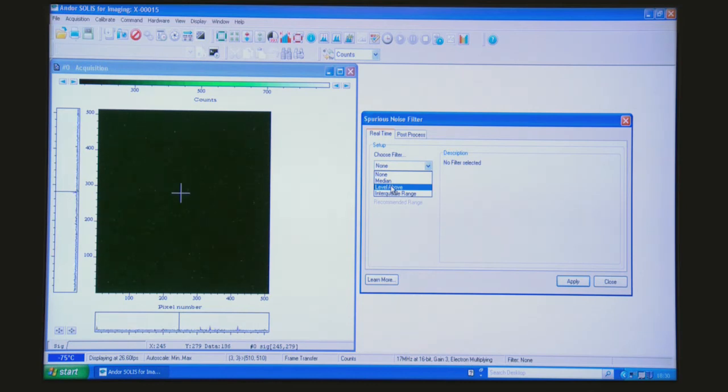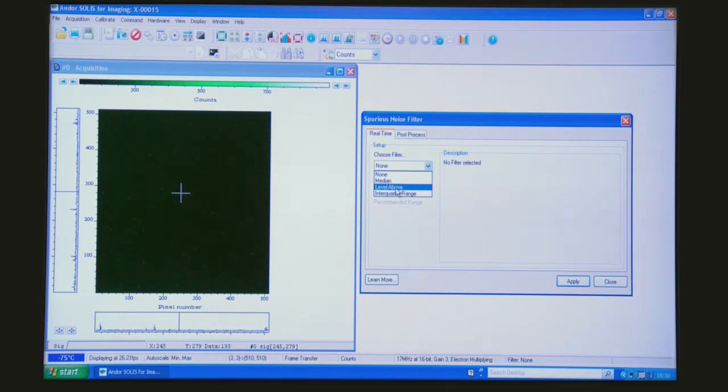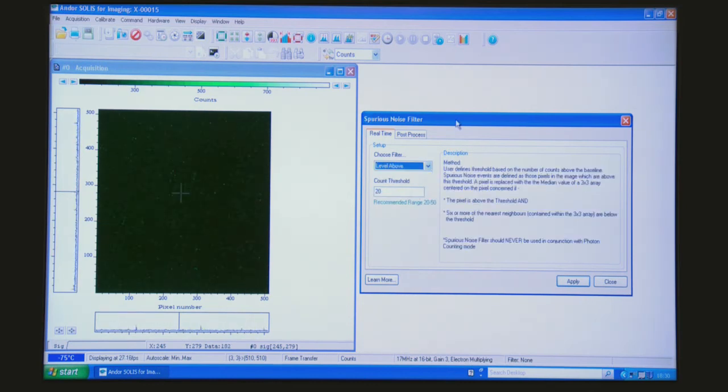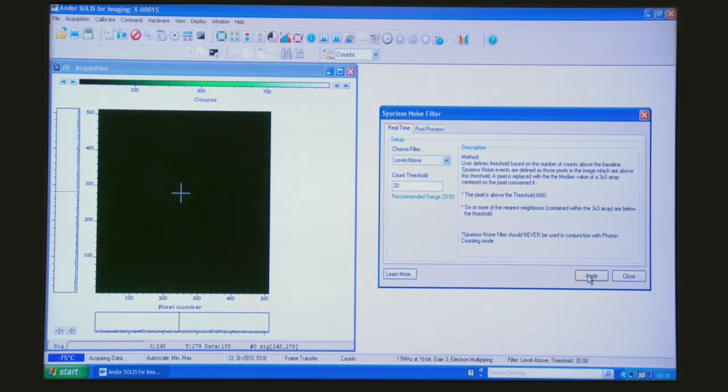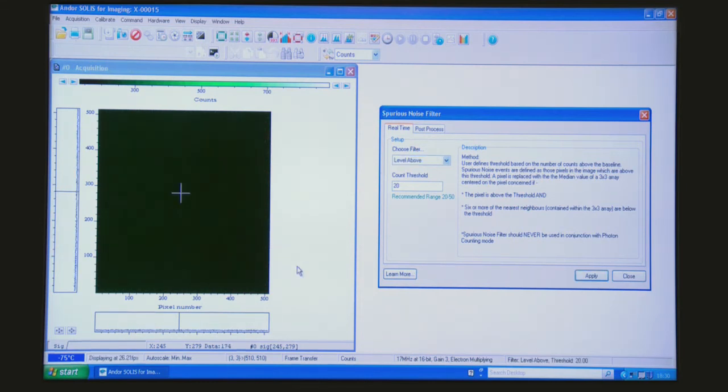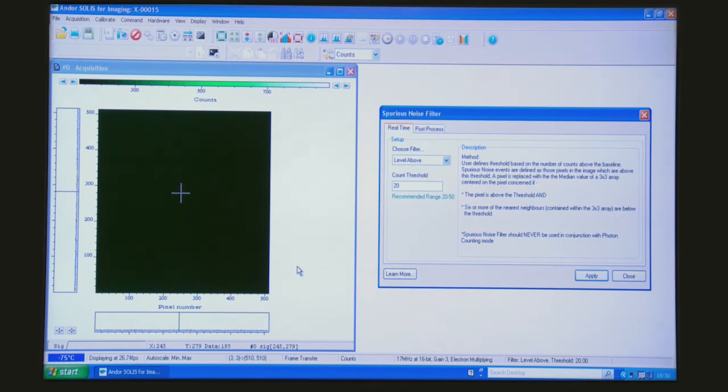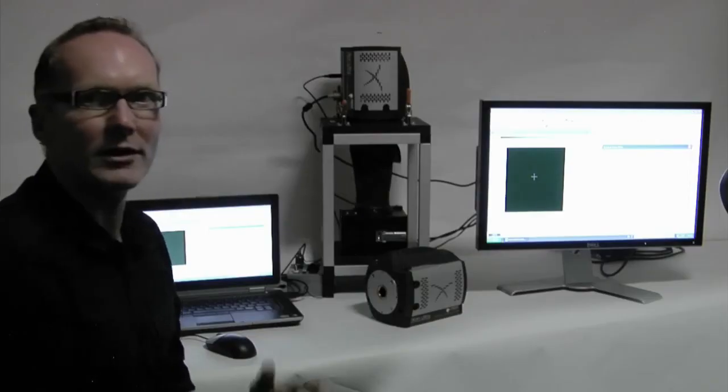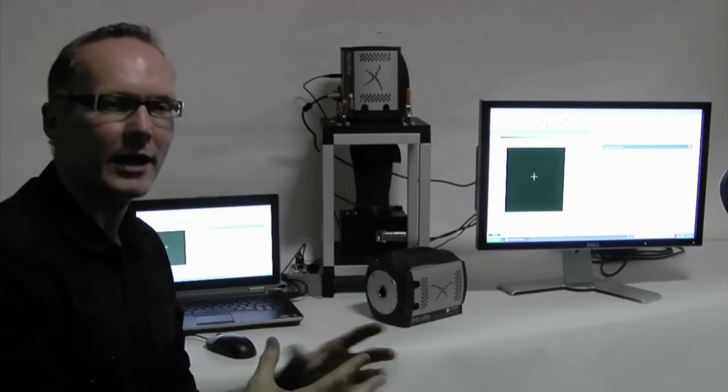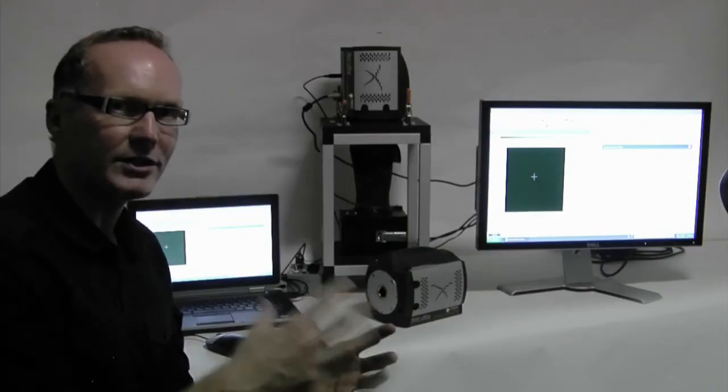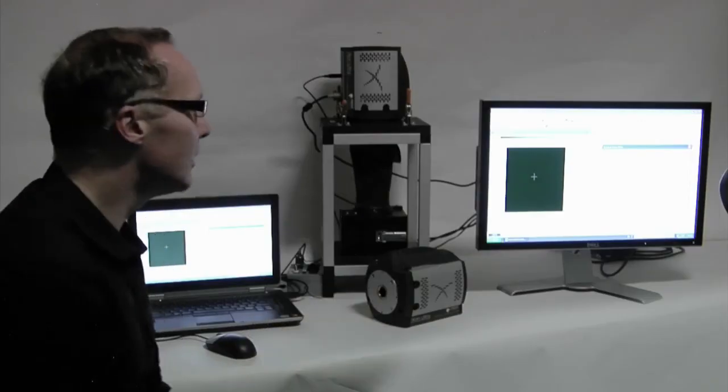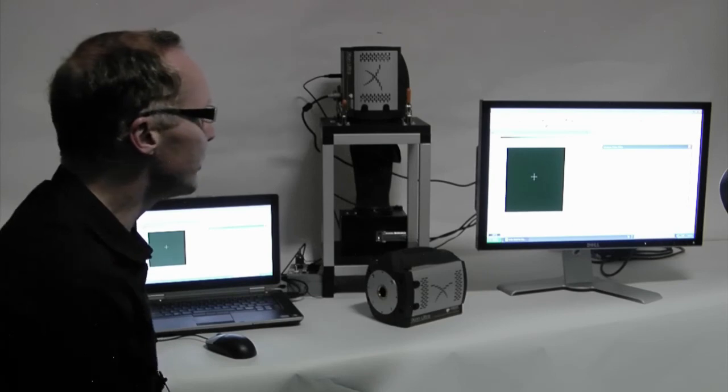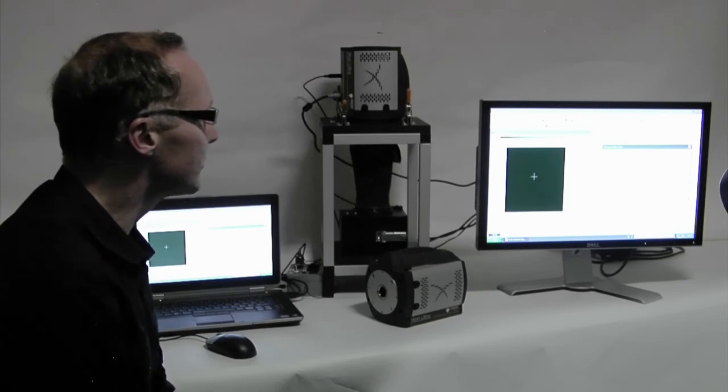But let's just choose the level above, and I can just apply that in real time. And you can see the speckly nature of the image has become drastically reduced by the real-time application, again within the FPGA of the camera, of the spurious noise filter.